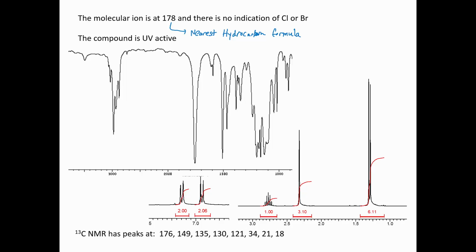Okay, and most people have maybe forgotten their multiplication tables by 12, but the place we're going to start here is with C13H22. We could start with C12, but then we need a ridiculously high number of hydrogens. That's more than that number of carbons can handle.